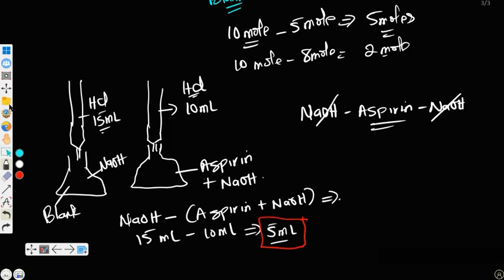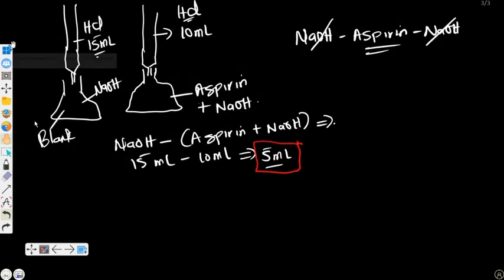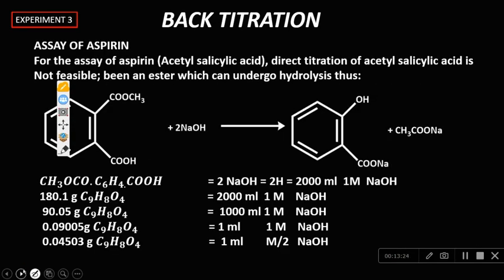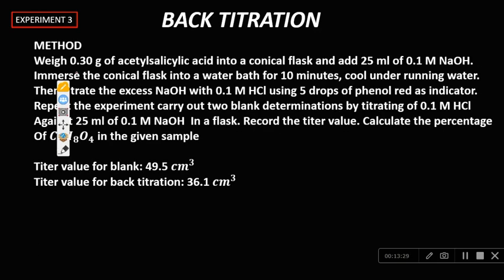So we have a particular practical question under this. Let's quickly run through this. The question says, okay, the question is very easy. Weigh 0.3 gram.